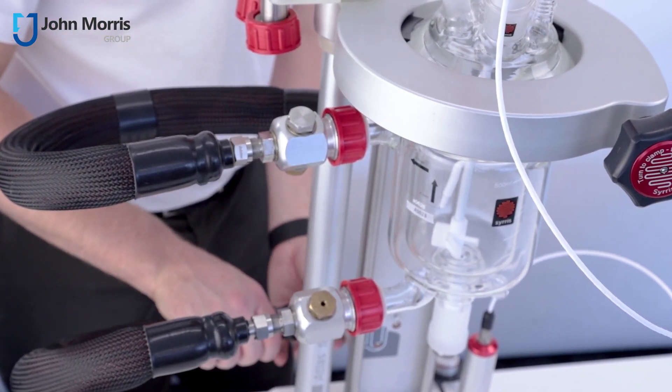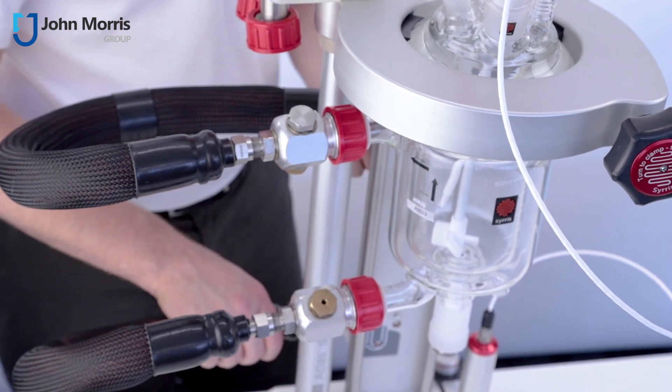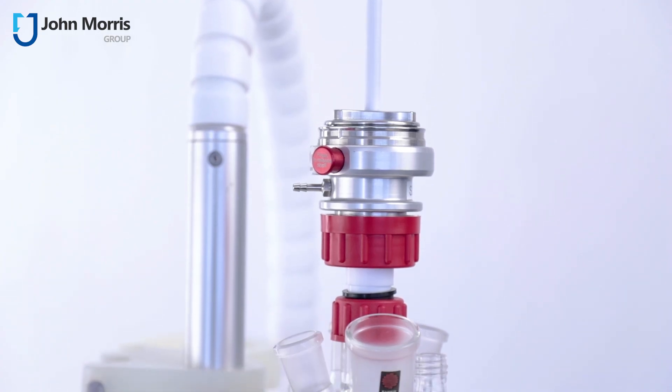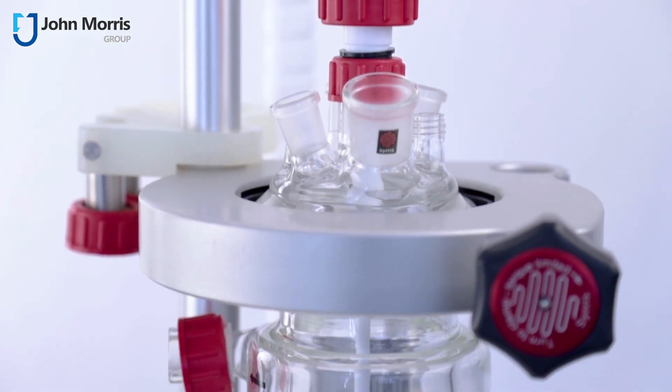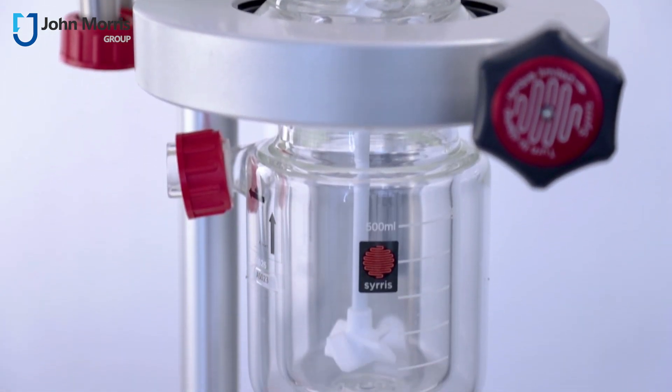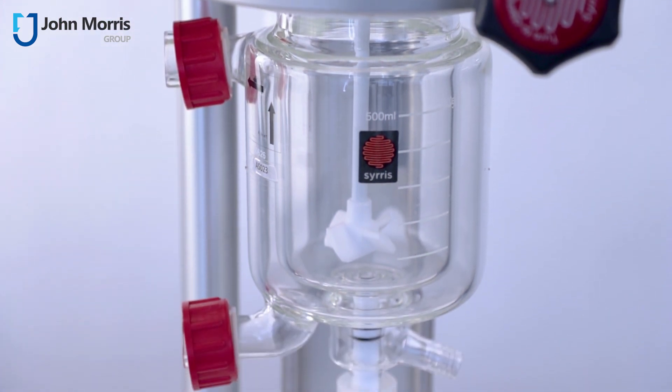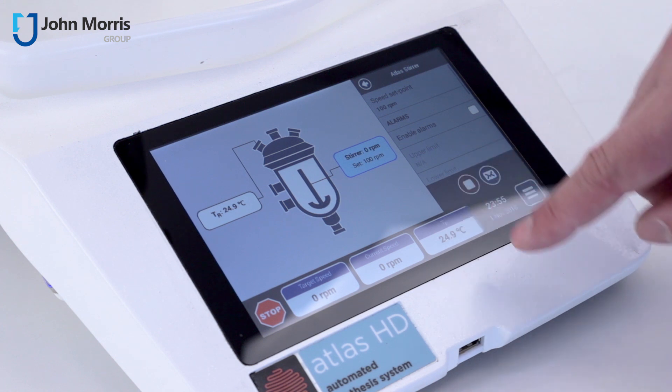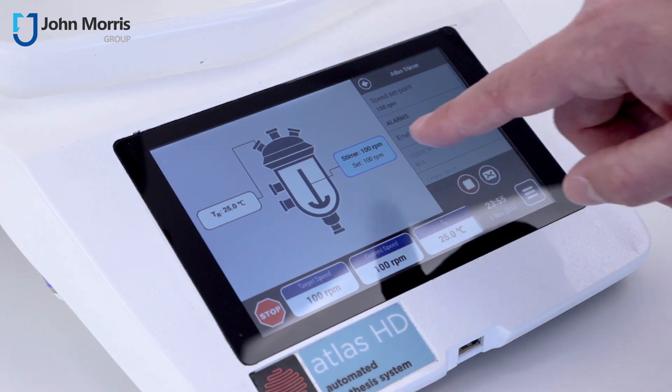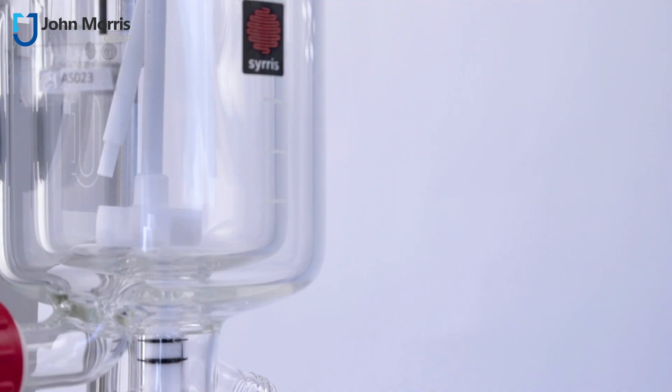Cirrus can control third-party devices using the Atlas PC software, so you can have a range of different sensors including turbidity, temperature, pressure, pH, automated dosing. And the Atlas HD has the capability to define and monitor reaction conditions with the fabulous touch screen. It allows you to change parameters such as stirring, heating, dosing in real time and display all data in a graphical way.